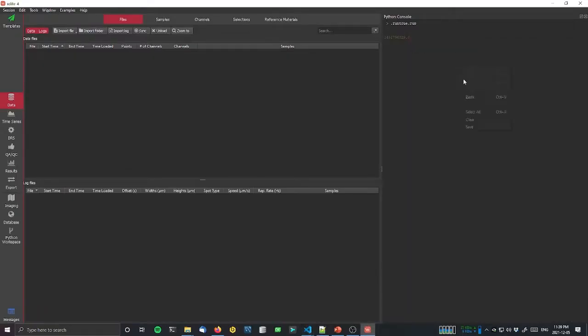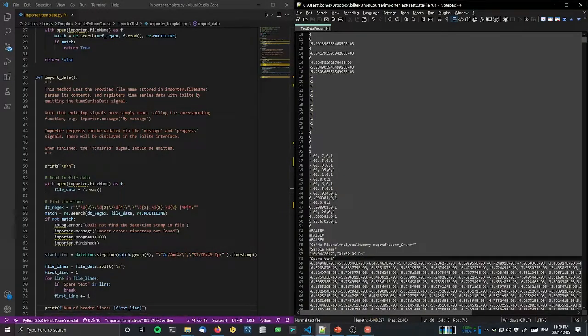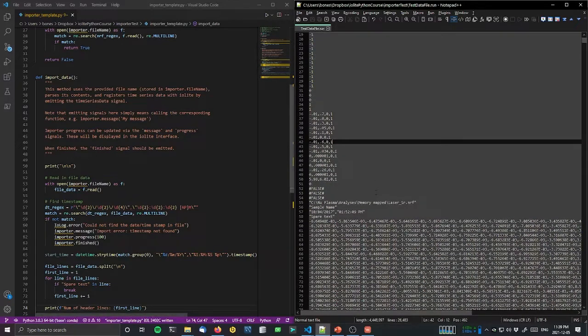So we'll just clear this first, import our file. It says 58, so we correctly found this. The other thing that we can do here is find our sample name while we're at it as well. If we've found our spare text and our sample name is always 2 lines before that, then we can just use list indexing to know that it's 2 items before this.